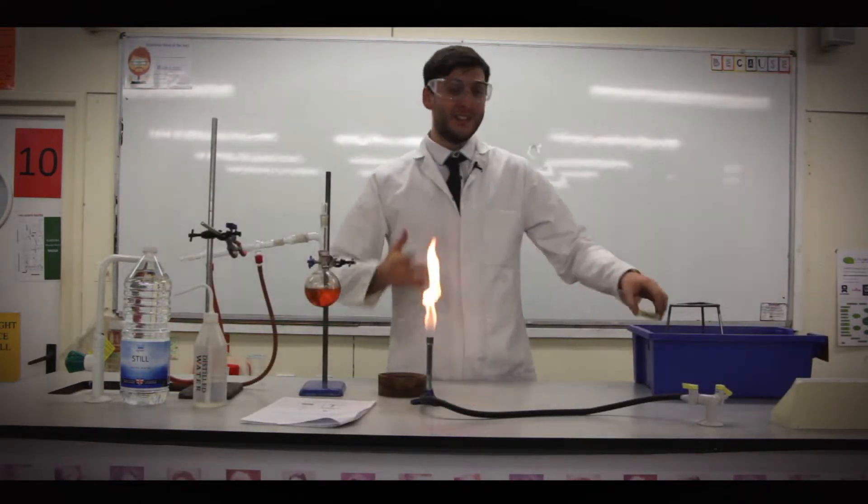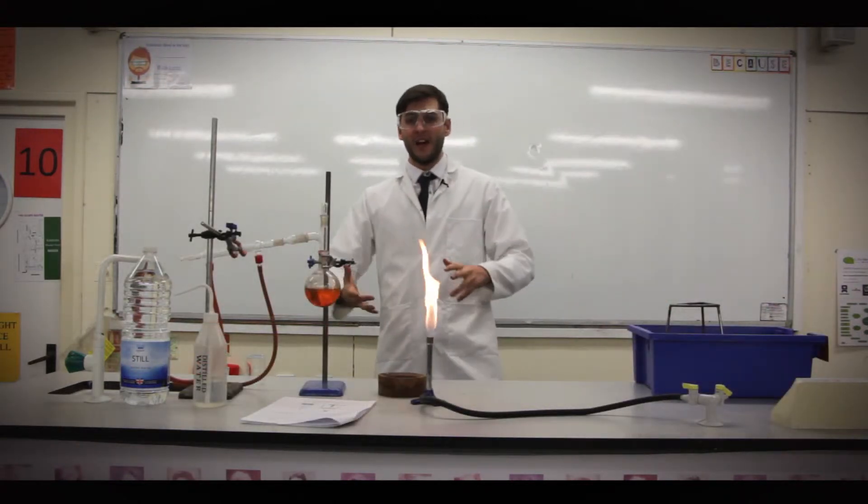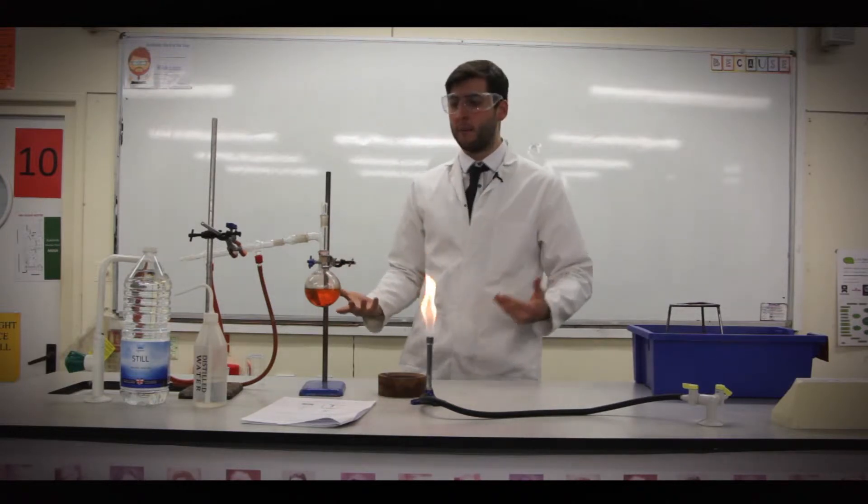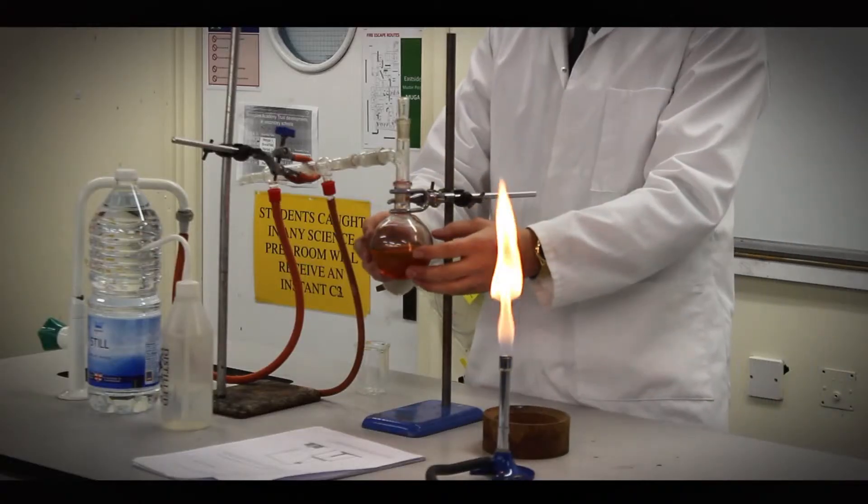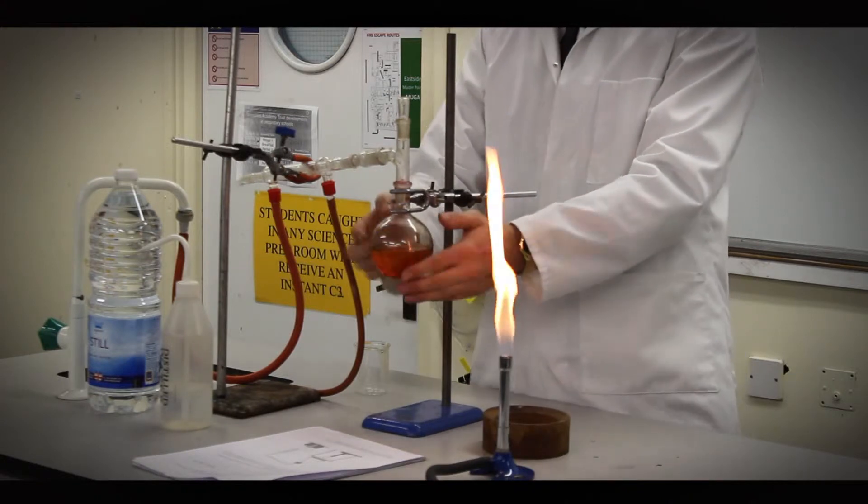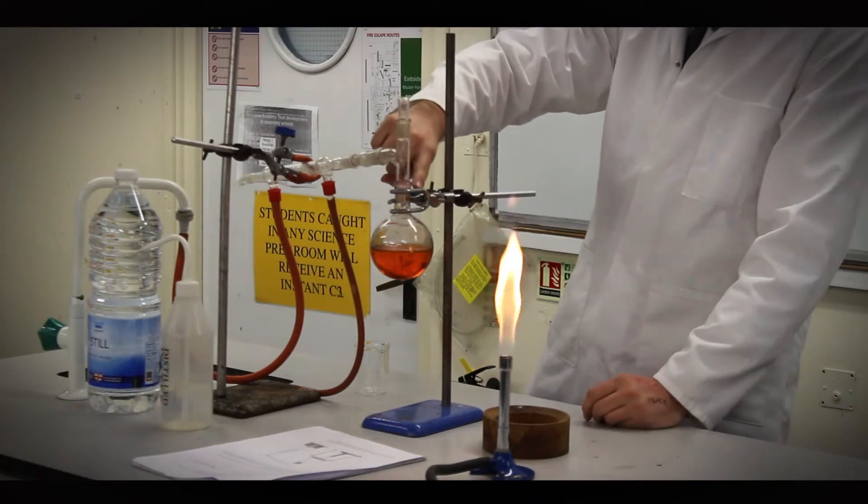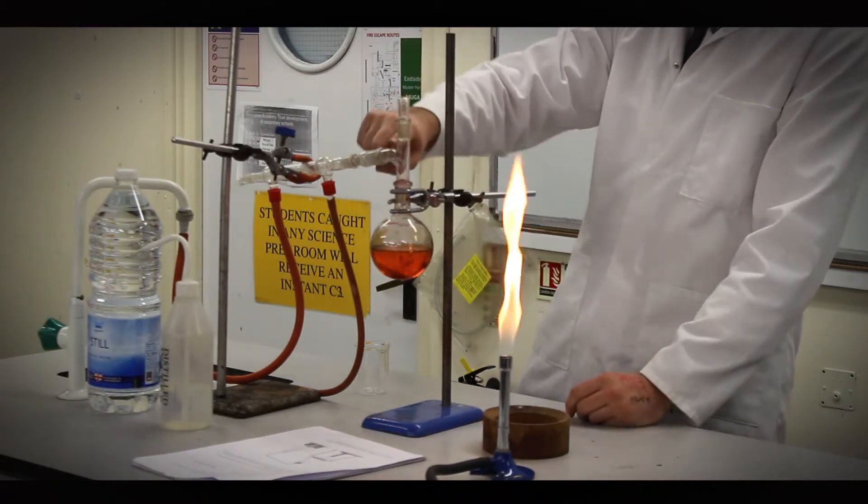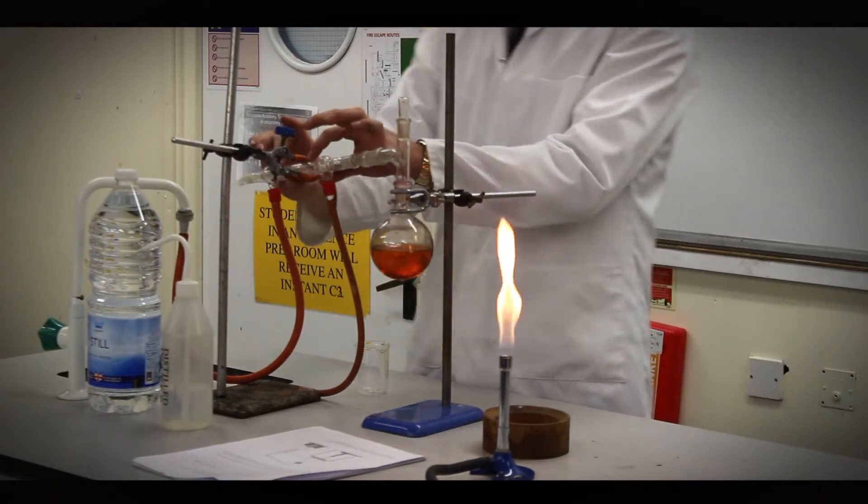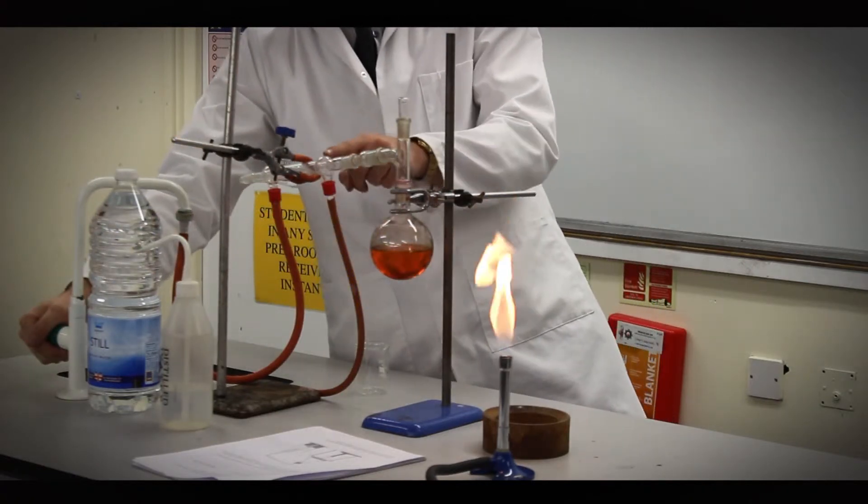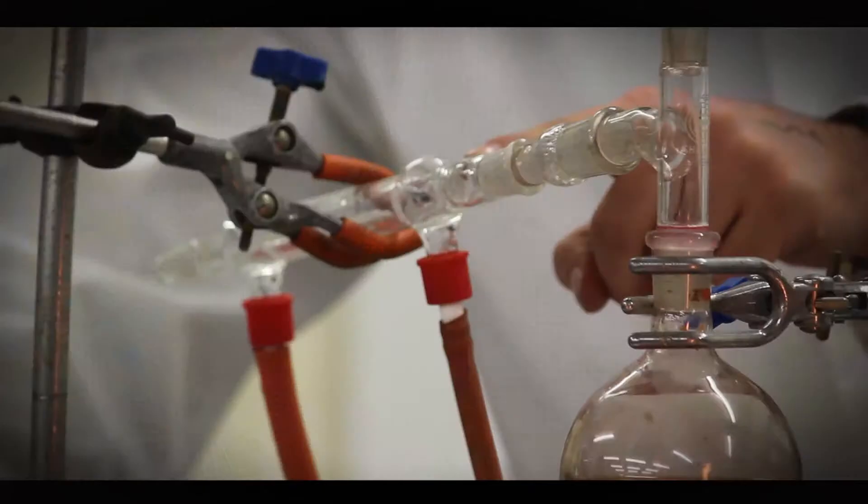So I'm going to do distillation for you guys. Now you will have done this in lessons, so this is more just a very quick recap. The first thing to point out, this is called a round-bottomed flask. Makes sense because it's got a round bottom. Then the gas, when we heat it up, will come up there into this, which is called a Liebig condenser, and I'm just going to turn on the tap now.